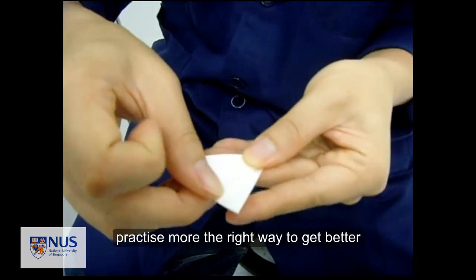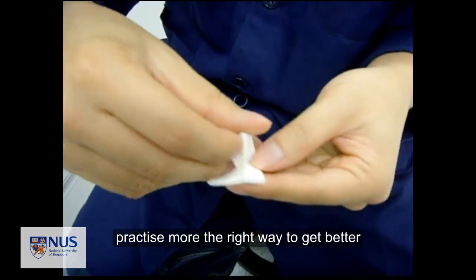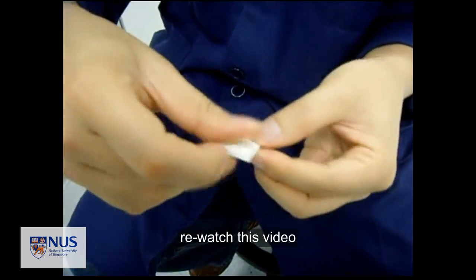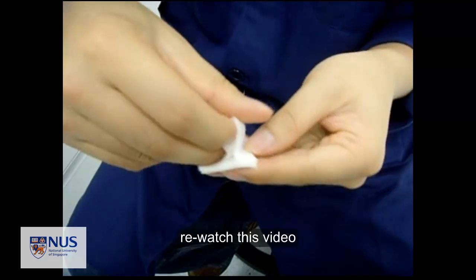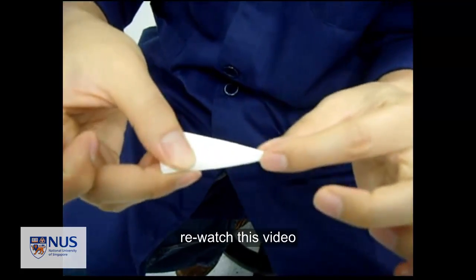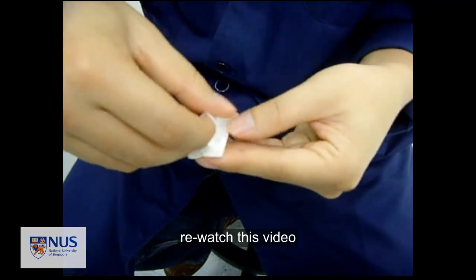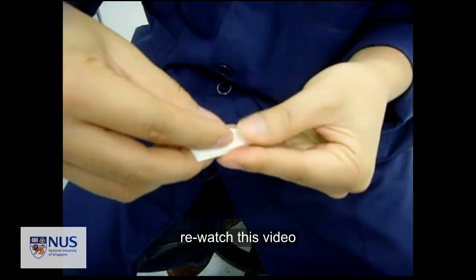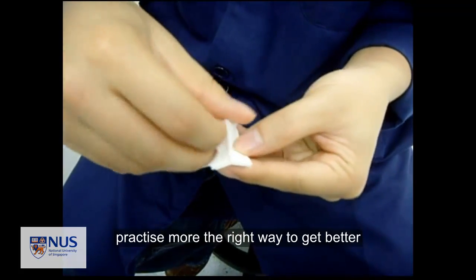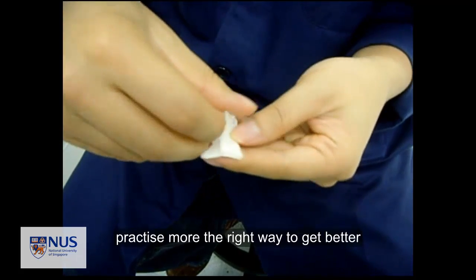You did one whole round. With more practice, I'm sure you can do it very fast and right. Always keep a sharp corner. Be professional — practice more.